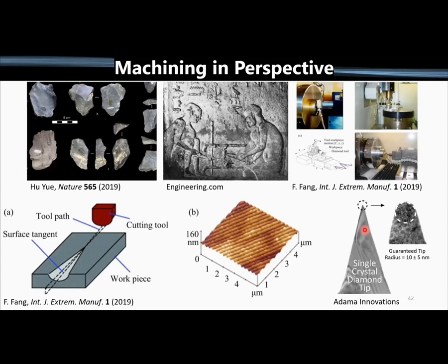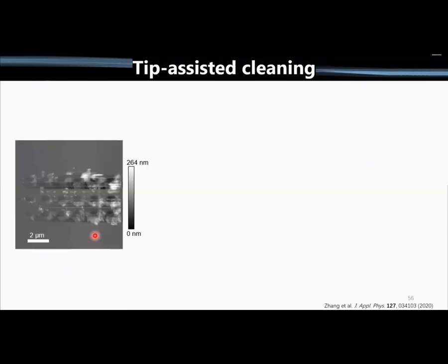Yeah, it's a very good question, and maybe you briefly saw something that I showed. The company claims that they've done some work to design the shape of the probe to cause material to move up the apex of the tip and away from the apex. It depends completely on the material that you're studying. But what I didn't show was that after machining, this is what it looks like. So the material is still there. Okay, yeah. So it gets pushed away.